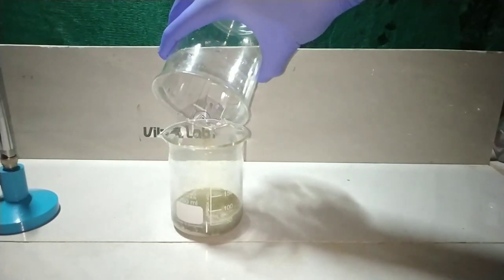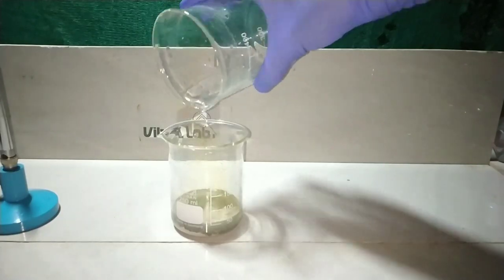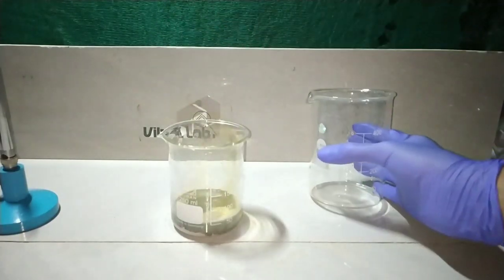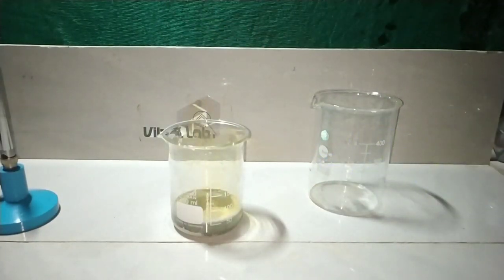Soon after adding the nitric acid, you see the reaction has started and brown fumes of nitrogen dioxide are formed. The reaction will be much faster because the metal is in its powdered form and the surface area is large.